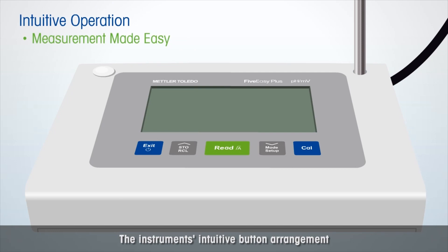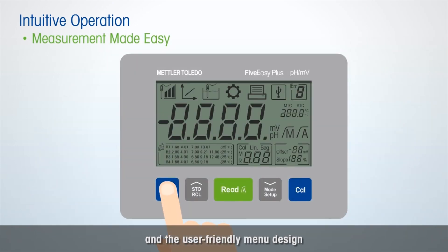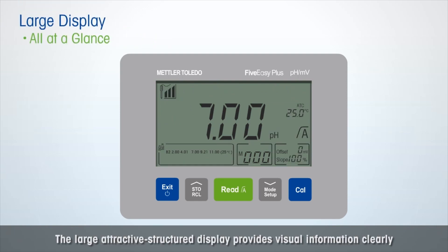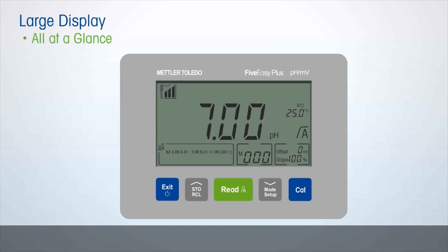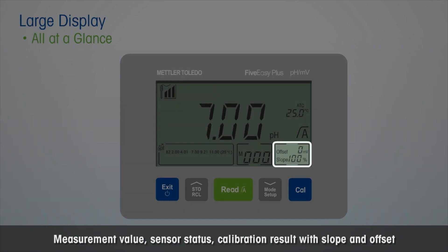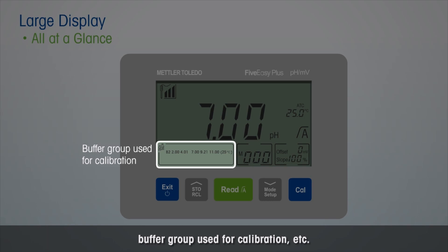The instrument's intuitive button arrangement and user-friendly menu design ensure measurements can be performed in just a few clicks. The large, attractive structured display provides visual information clearly: measurement value, sensor status, calibration result with slope and offset, buffer group used for calibration, etc.